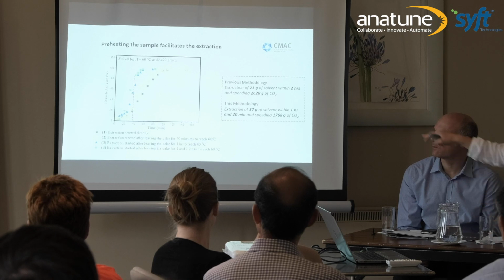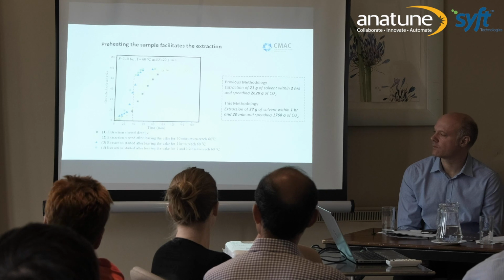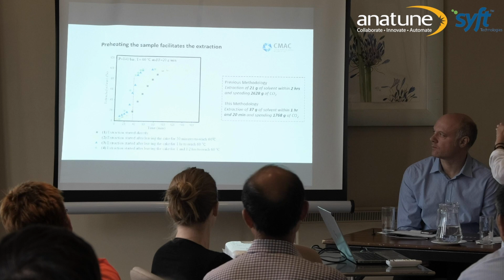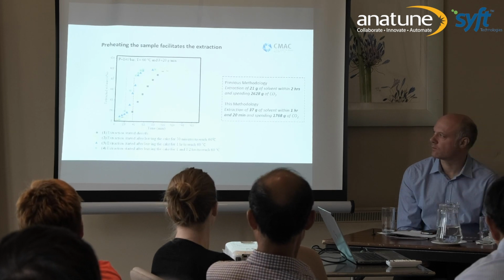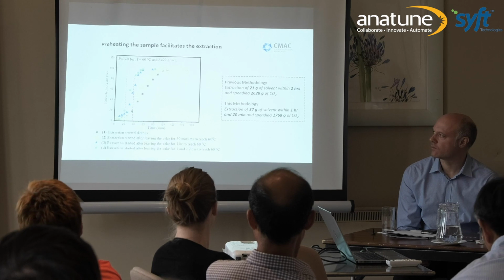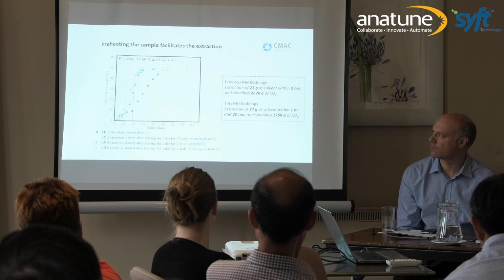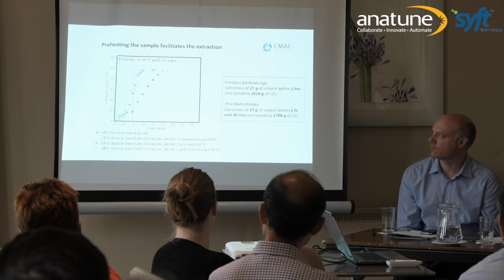While in the third and the fourth experiment, we left the cake to preheat, for 1 hour and 1 hour and a half. The extraction curves are shifted to the left, and the fast zone started after 20 minutes. Generally, the total extraction time in the third and the fourth experiment is reduced by half. So definitely, the process is more efficient using preheating, and we spend less carbon dioxide.